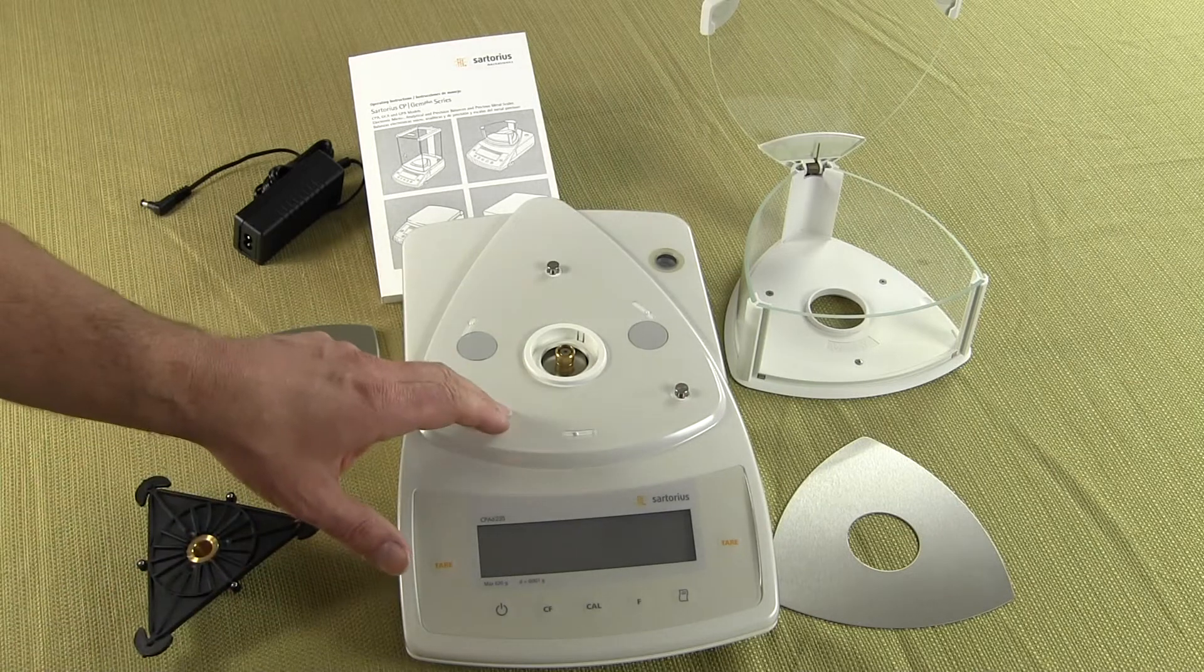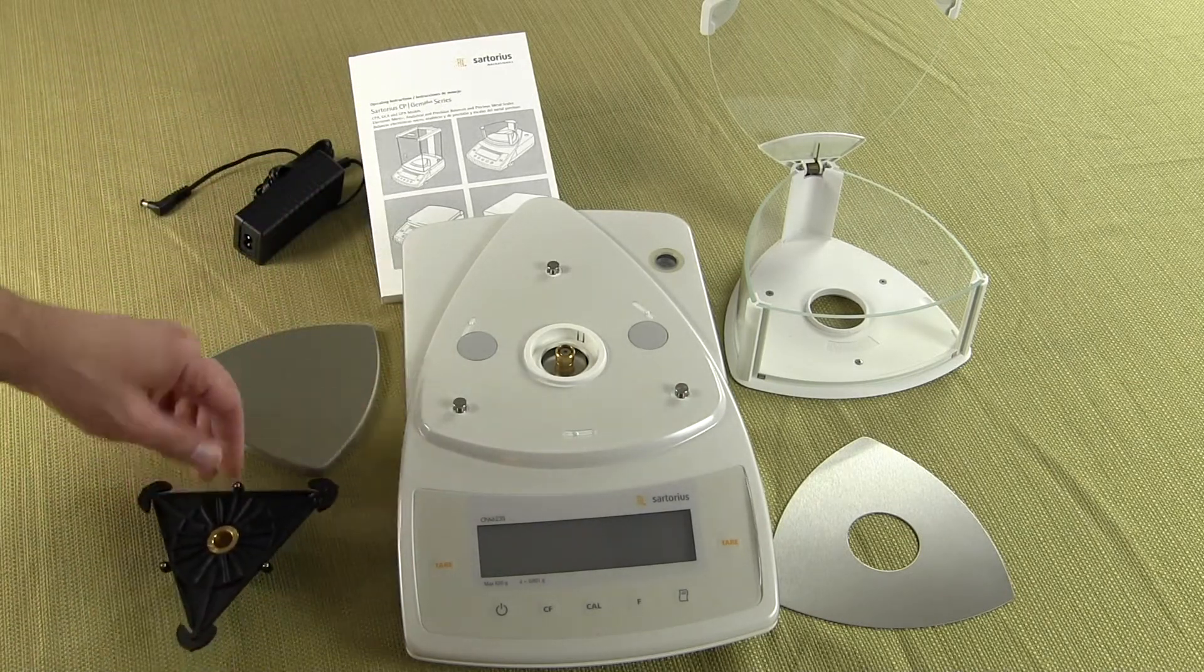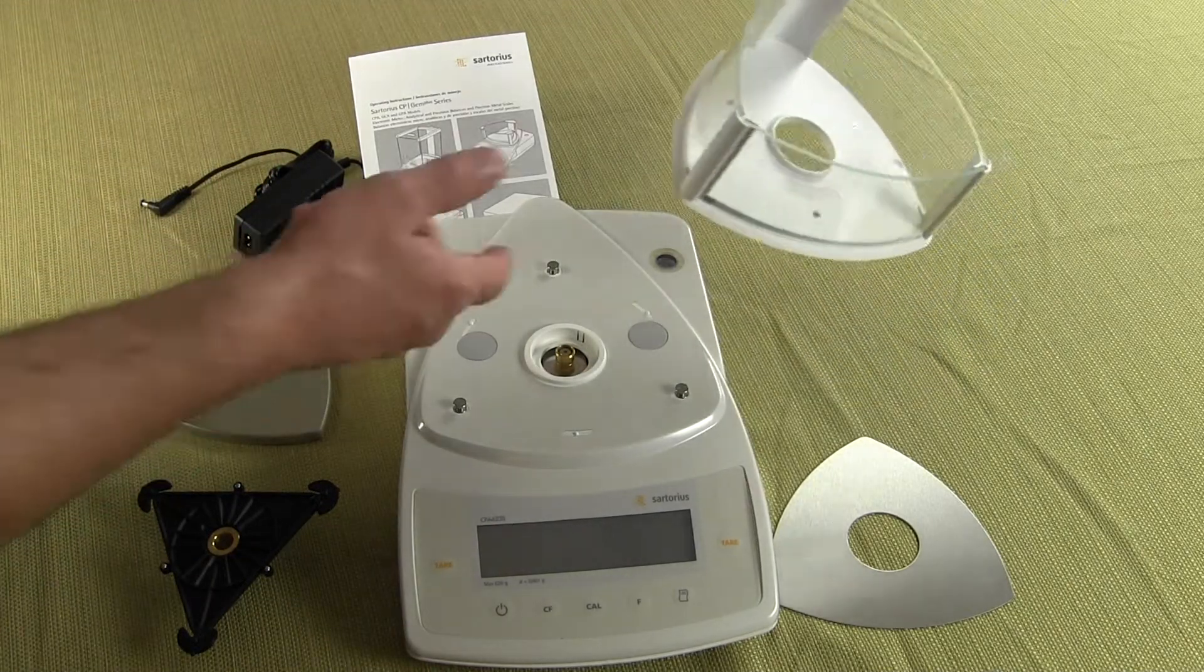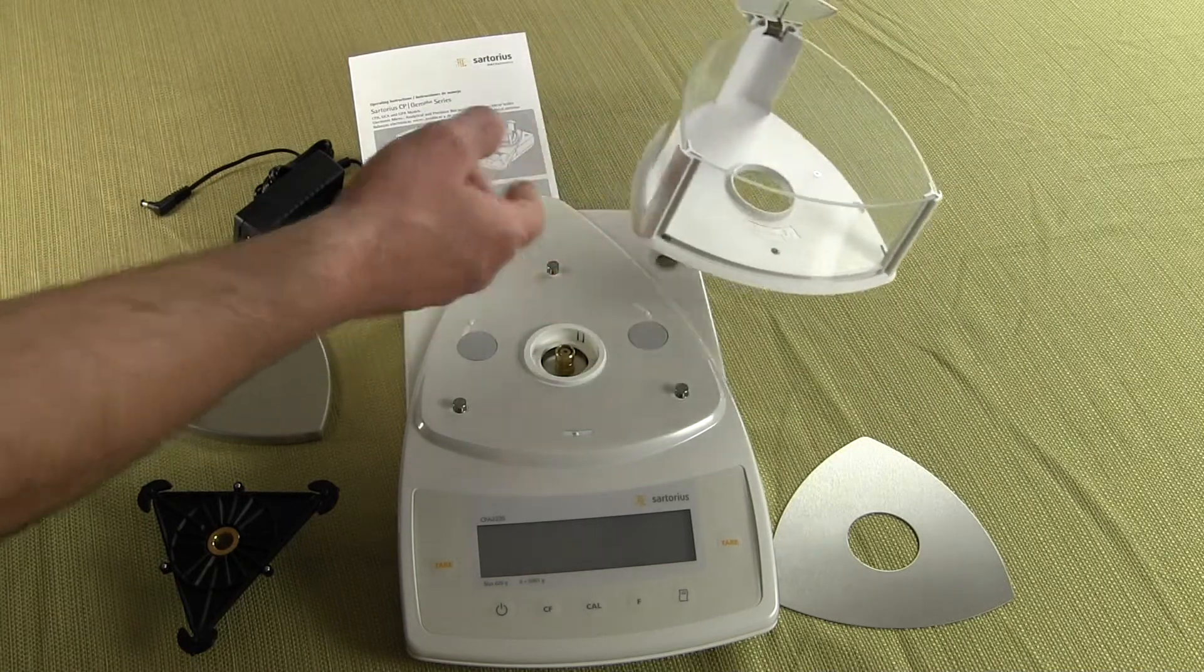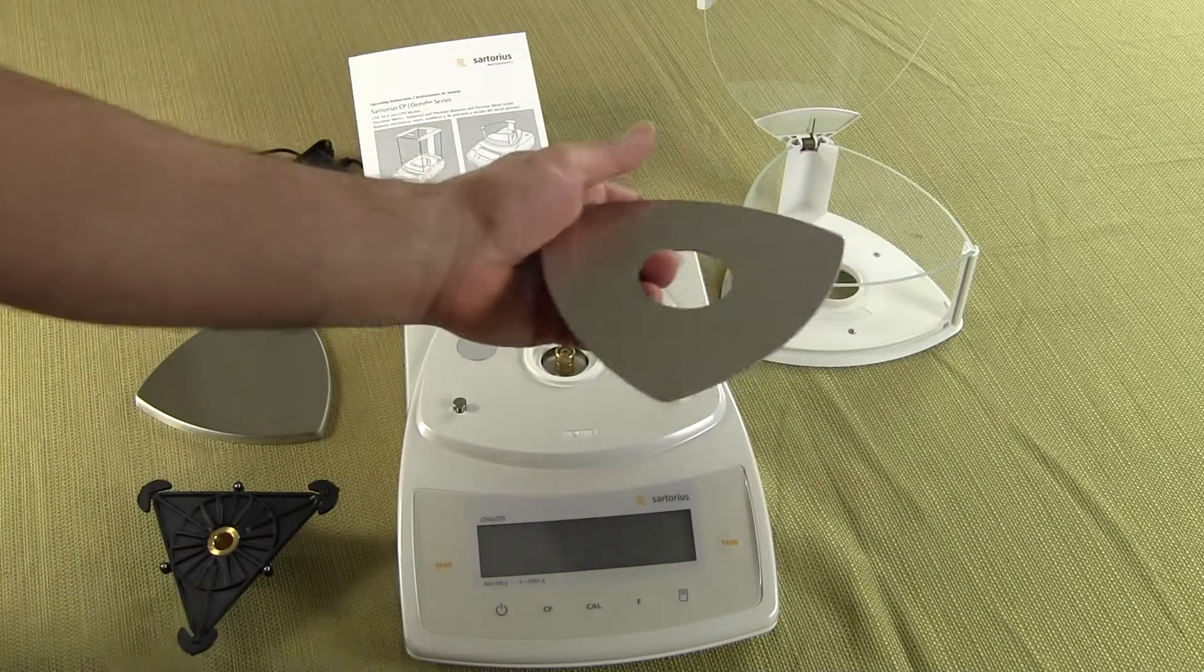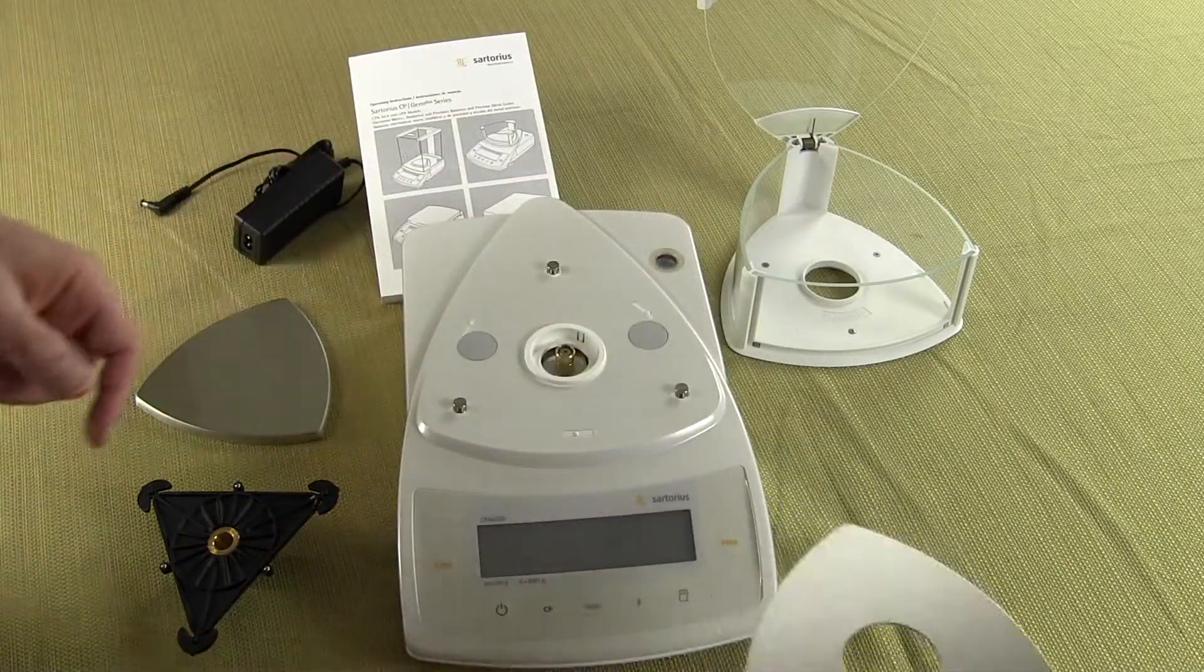So we have the balance itself, we have the support pan, we have the pan itself, and then this here is our draft shield and we'll show you how to install that. And then this is a stainless steel plate that goes on the bottom of the balance in the draft shield for easy cleanup.